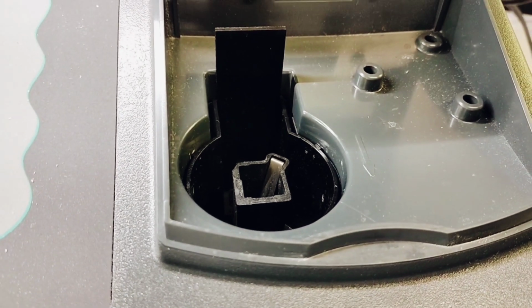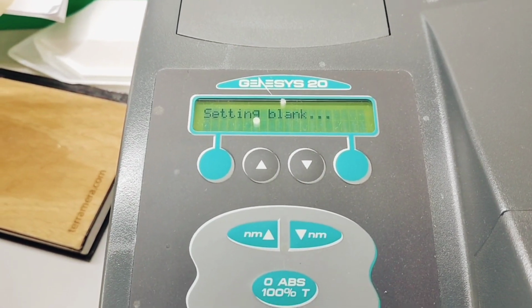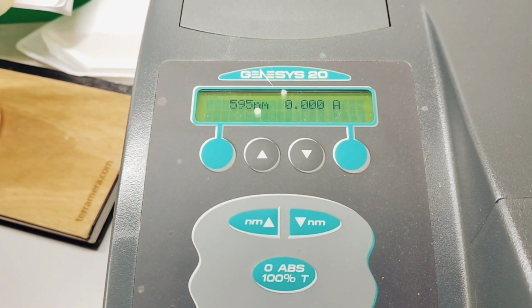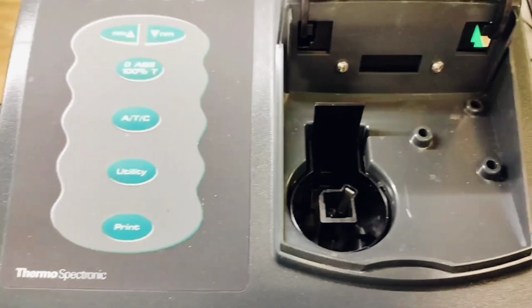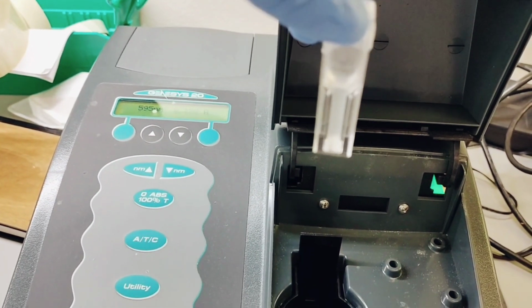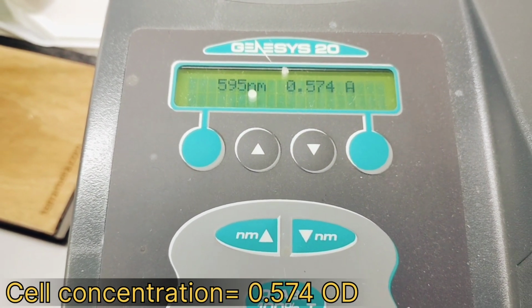This is what it looks like. So I'm going to blank the machine with water. Remember, it's at 595. I'll press absorbance, and 00. So I'll just take the blank out and then put my sample in and then take the reading. That's the sample. Came from that. Put it in. And the reading is 0.574, so that's absorbance.